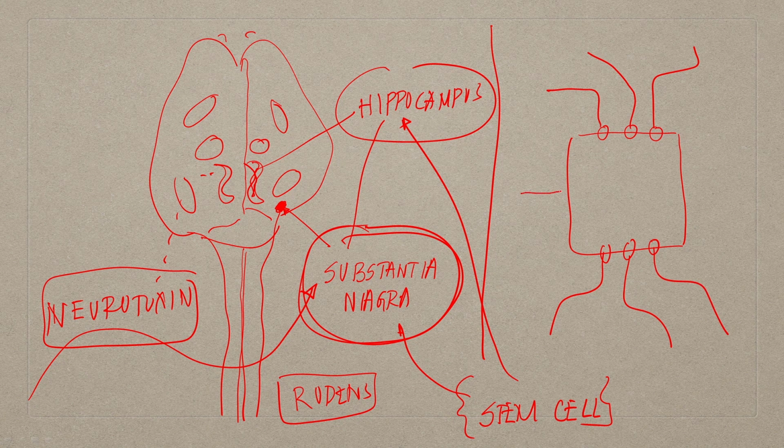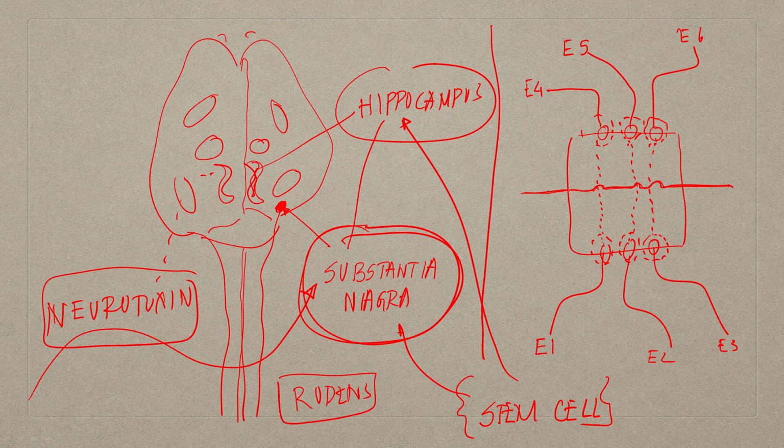Okay. Now, you create these dotted lines showing where the neurons can grow, and these are extracellular matrix printed upon the electrode surface as well as the non-electrode surface. These Es stand for electrodes: E1, E2, E3, E4, E5, E6. This is a simple case study I am showing you. What you see out here are small tunnels, big enough to allow a neuronal process to grow, but not big enough for the cell to cross through. Okay. Now, you take these substantia nigra cells and you plate them here.